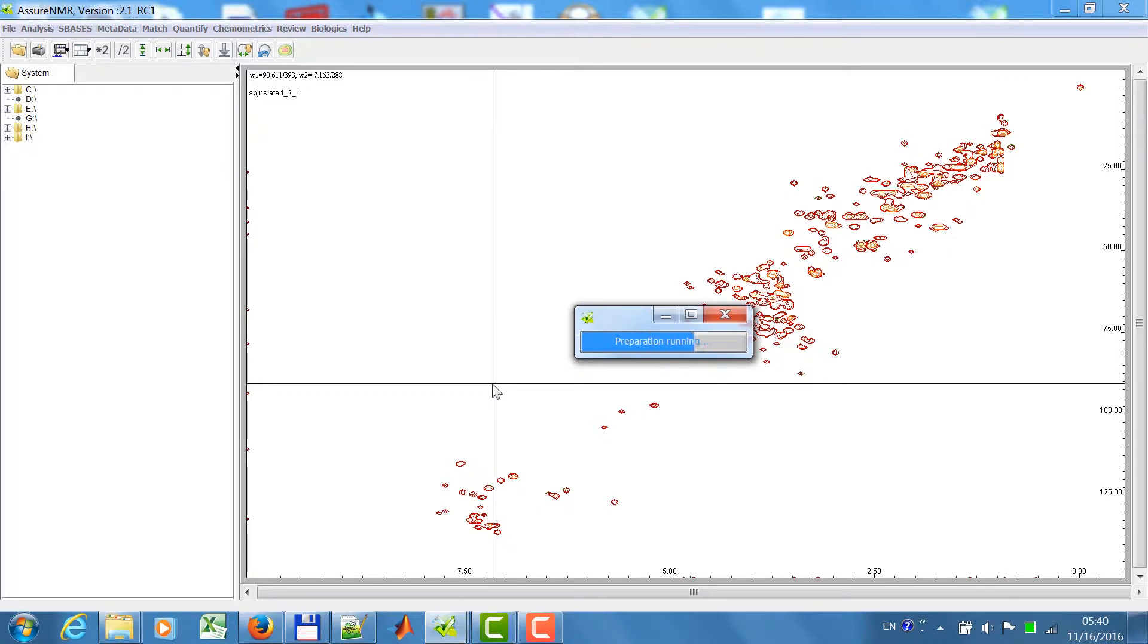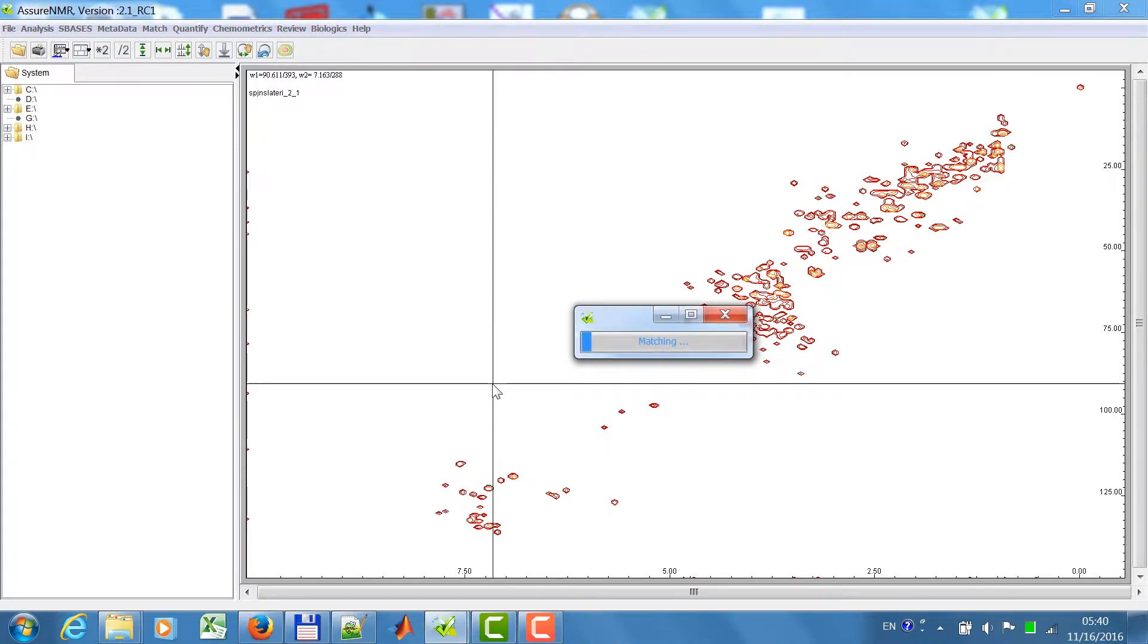Now the spectra is peak picked. All the reference spectra is loaded in and now the matching is performed.